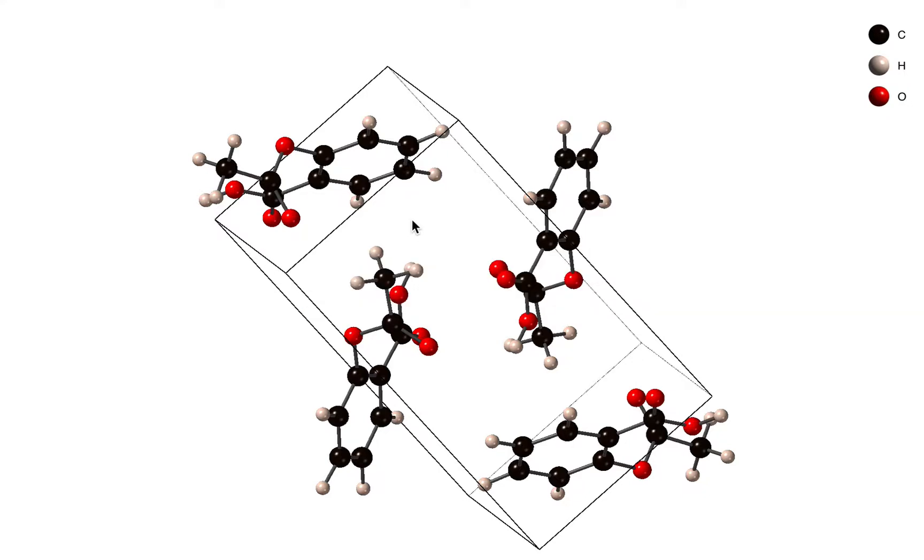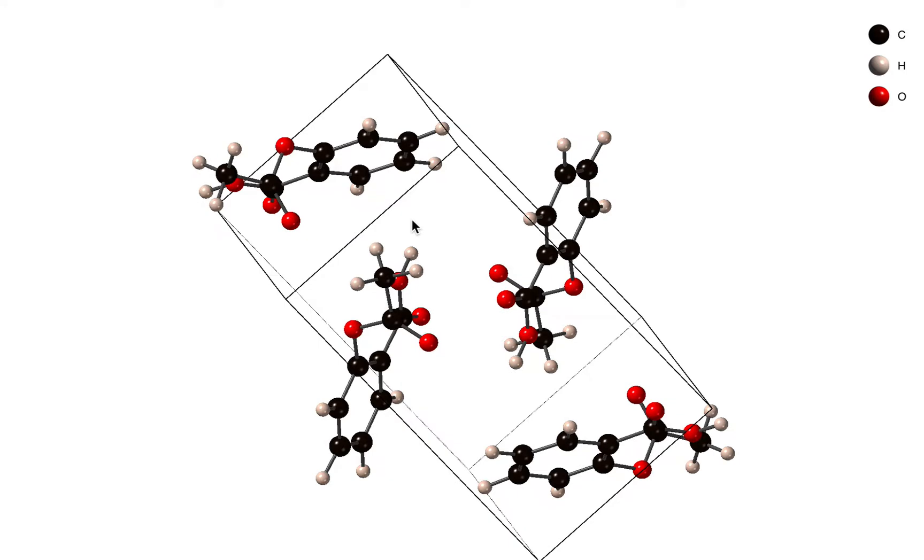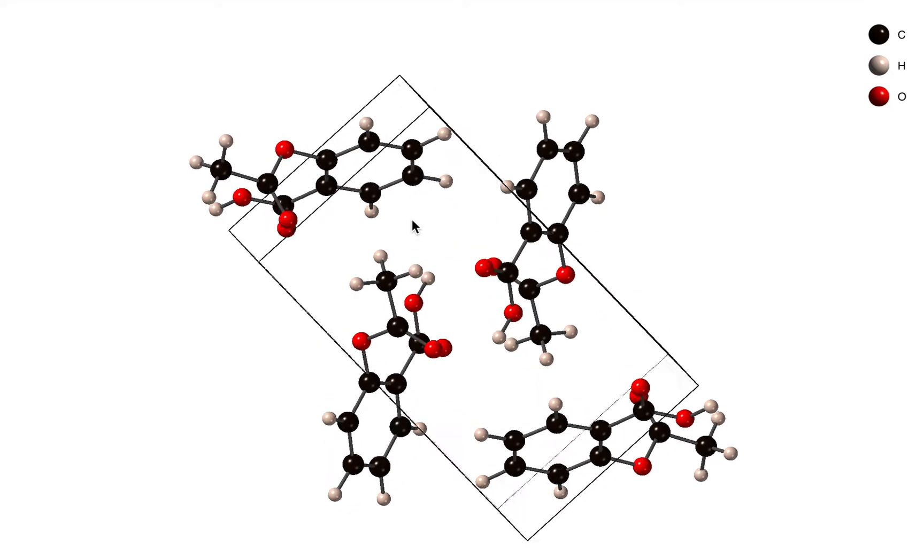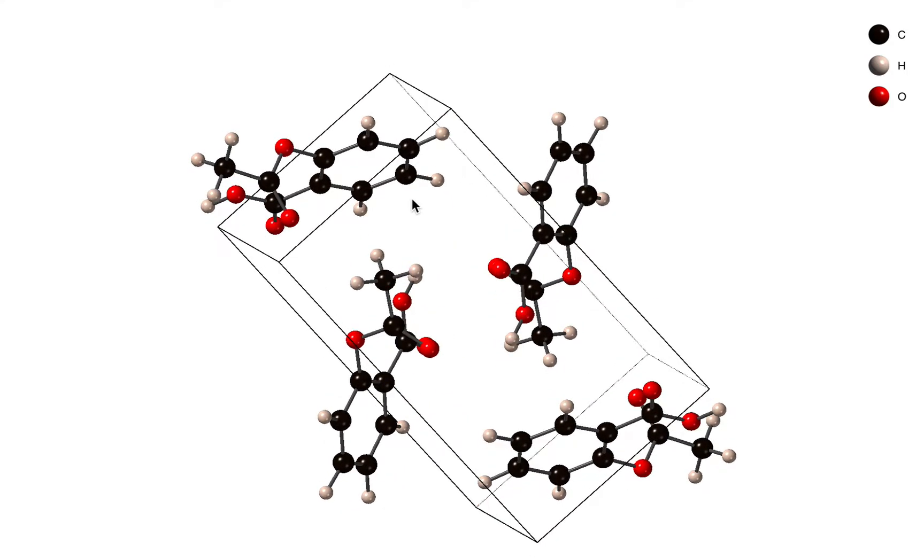Now the next thing we might want to do is get the best fit plane through part of a molecule. We can see that these molecules, these are aspirin molecules, they contain rings.